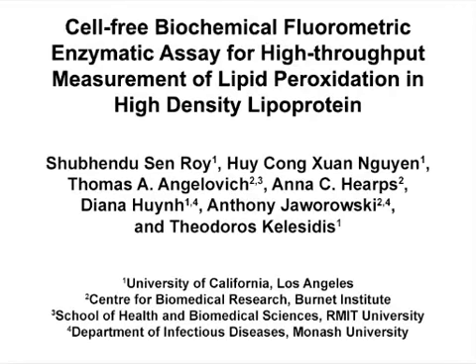The overall goal of this experimental method is to determine the function of high-density lipoprotein using a biochemical cell-free assay that measures the lipid peroxide content of a specific amount of HDL.